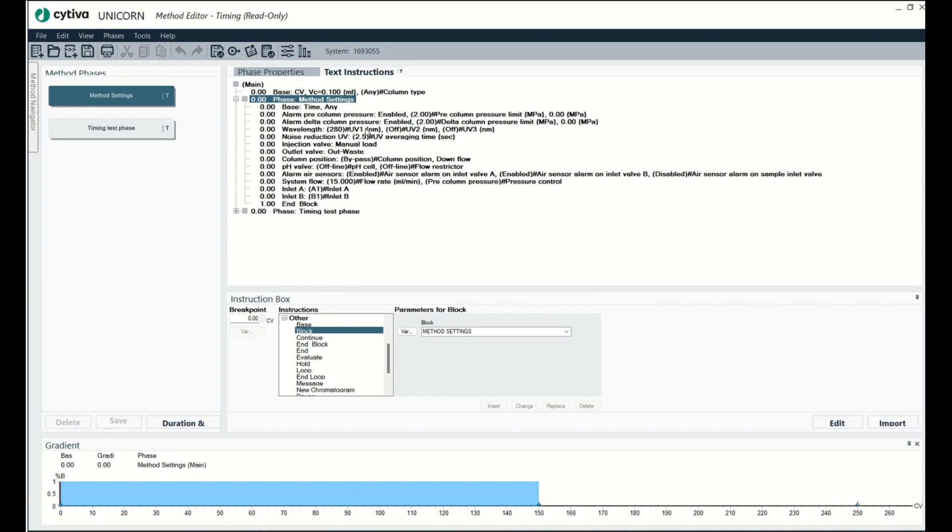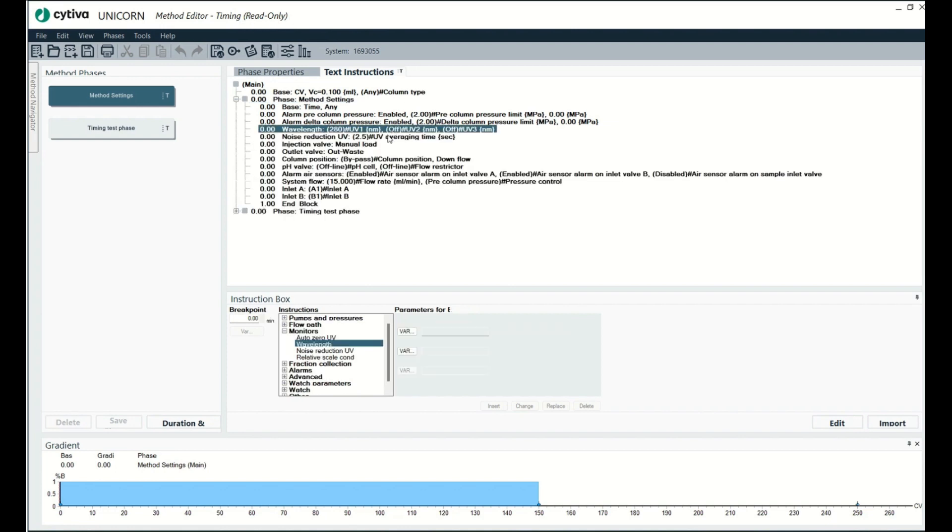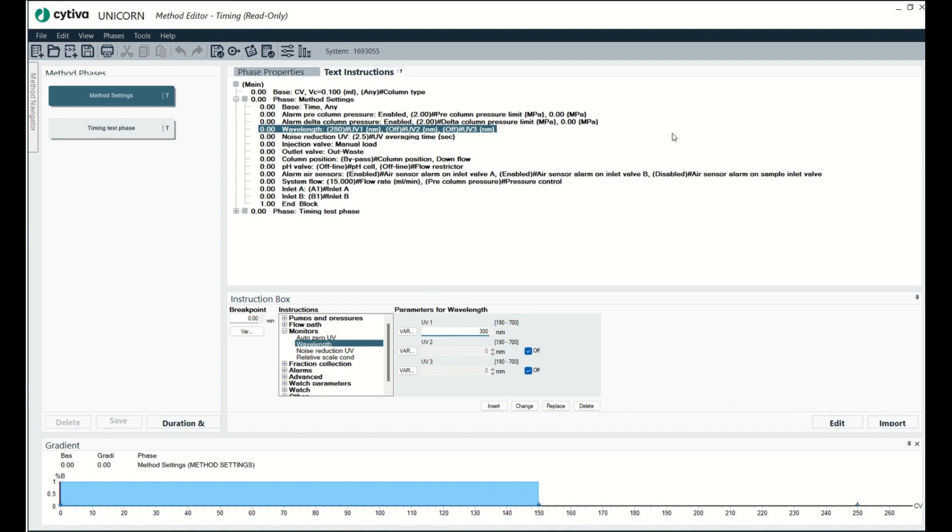So now this file is locked. I can't ever change it again as long as it has this name right here, timing. So you can see it says read only right here. If I want to go to 280 right here, what I'm doing is proving to you that you can't really change it. So I'm going to go to 300. I'll hit change, right? But if I hit change right there, nothing really happens. I still have the star, which means I need to save it.